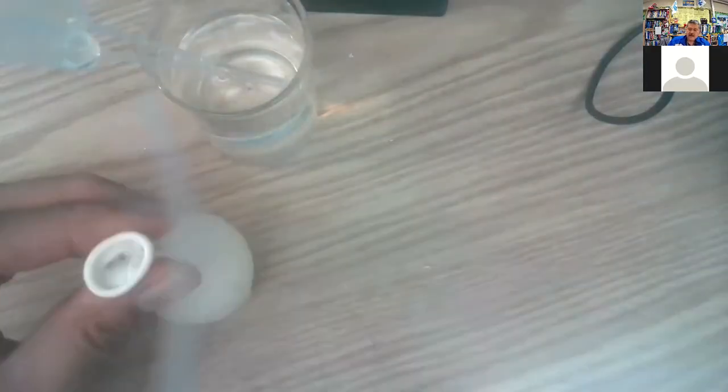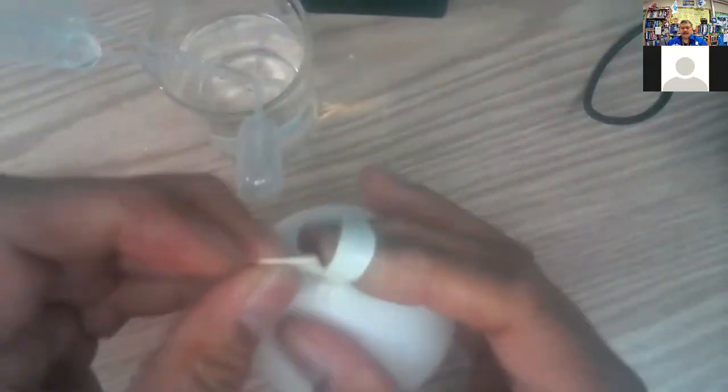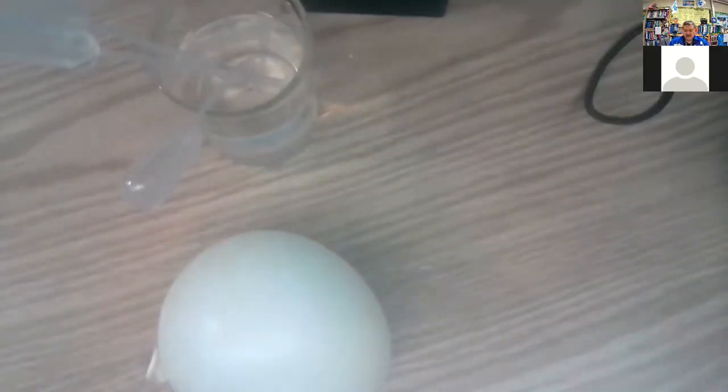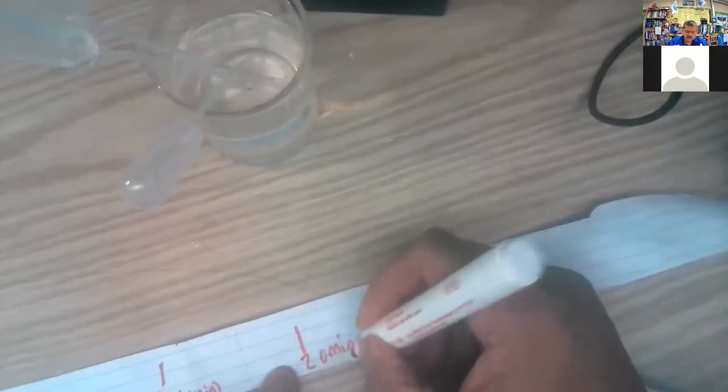2, 3, 4, and 5. Woo! Got it in there. And there goes. There's number 2. This one already you can see it's going, so I'm going to try to get a quick measurement. There it is. Okay, there's my 2 measurement. What's 3 going to be like? There's 2 with 0 minutes.